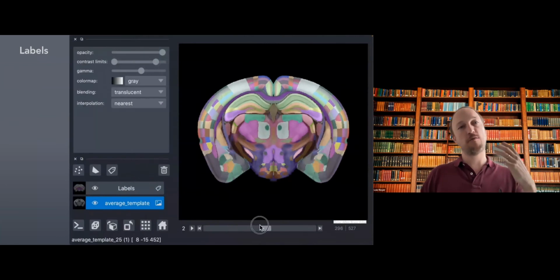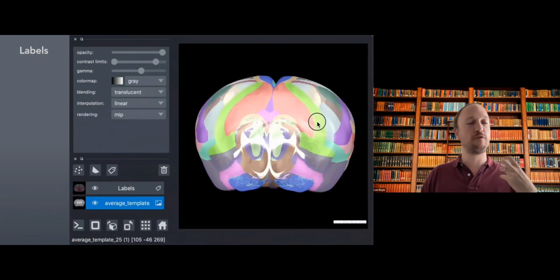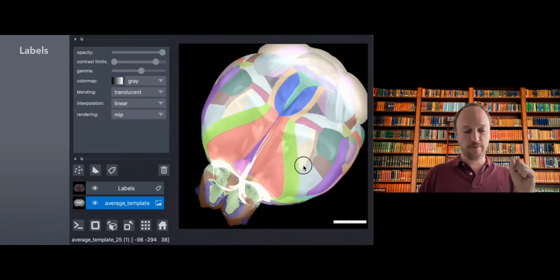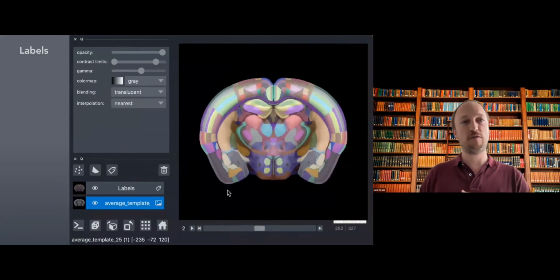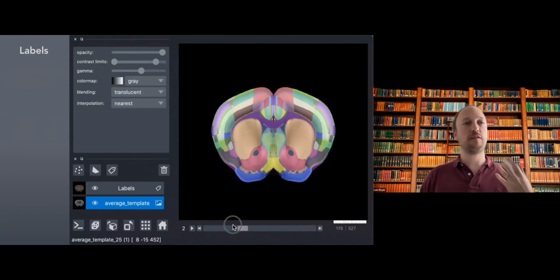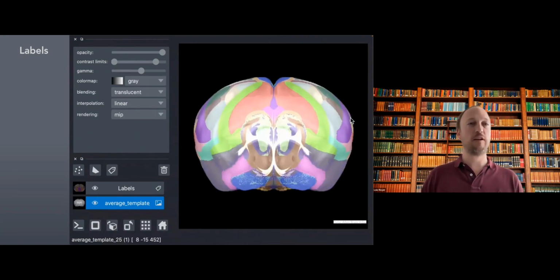One of the key things with Napari is that we really pushed for everything to be ND from the get-go. This is something that Juan Nunez-Iglesias was always pushing, and it also came from his efforts to do the same thing in scikit-image. So every step of the way, we're really trying to make sure that everything works in n dimensions.